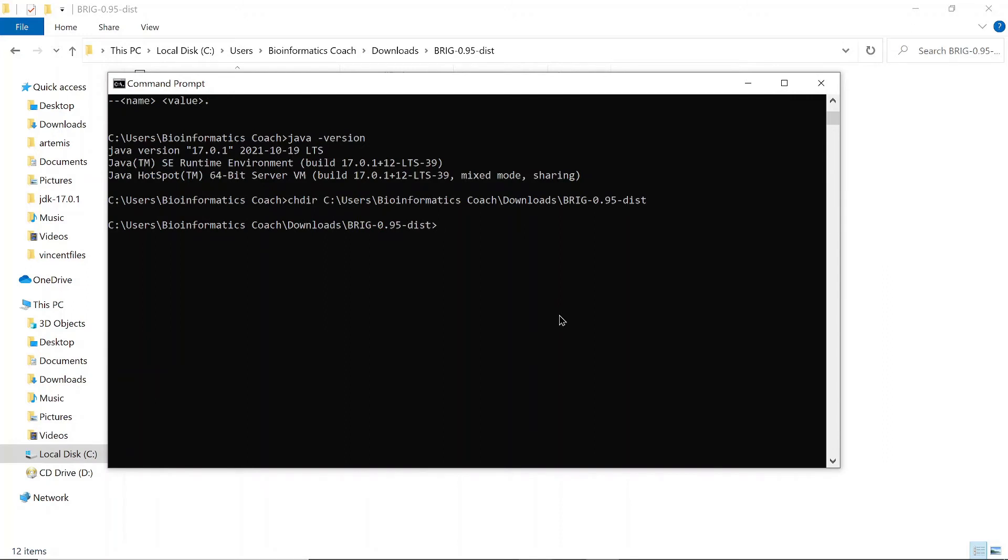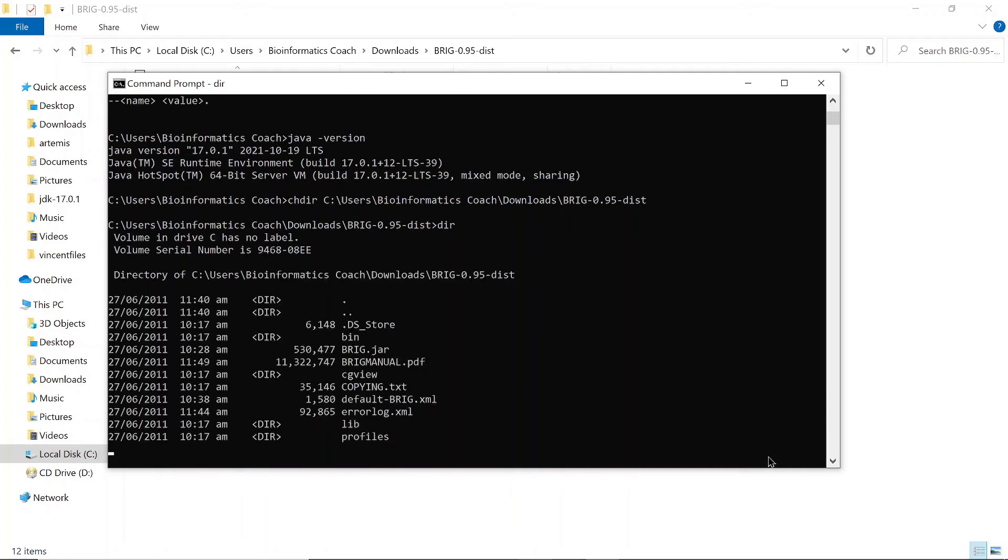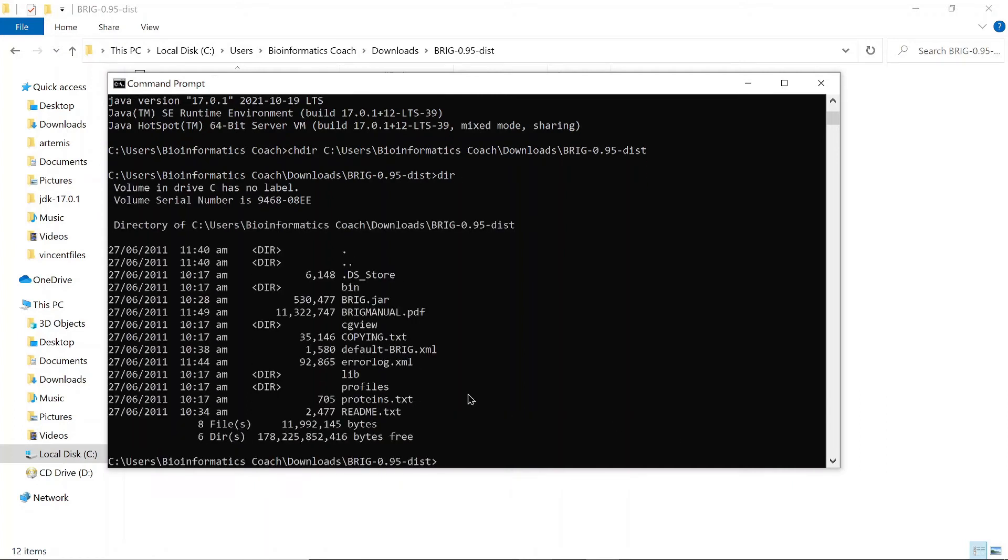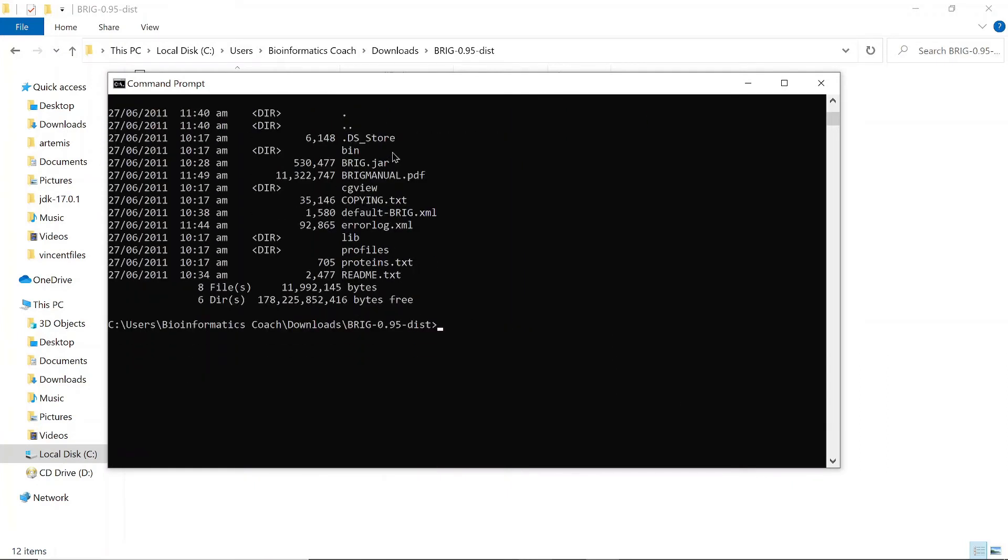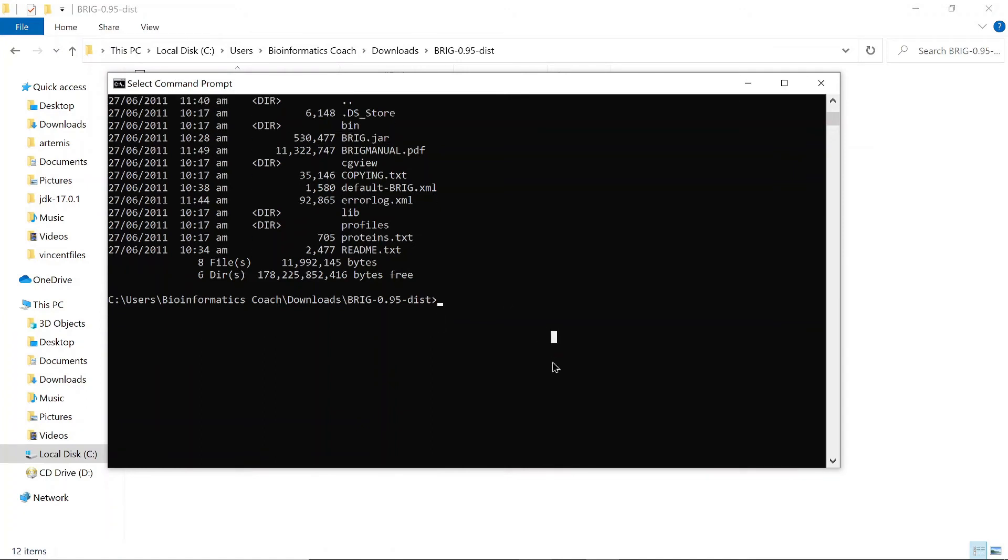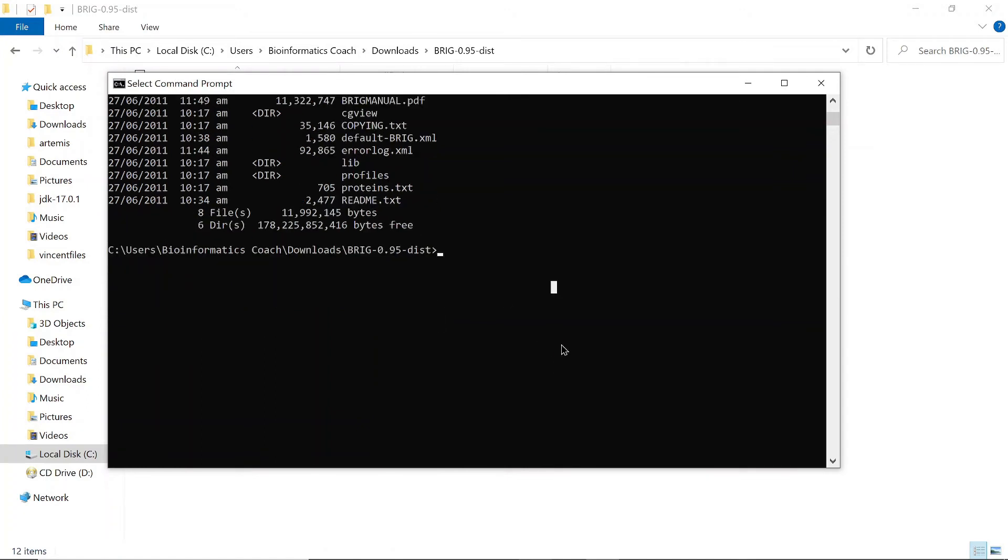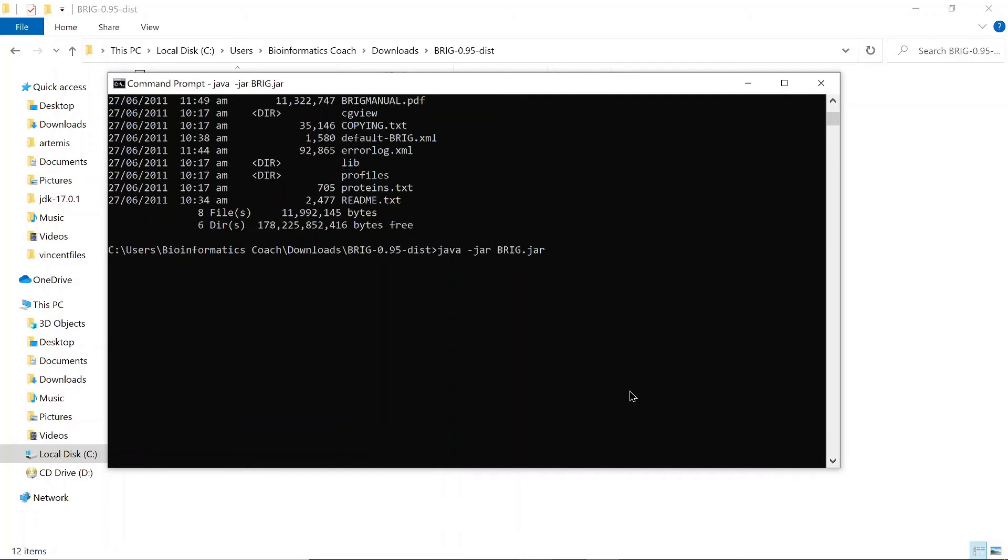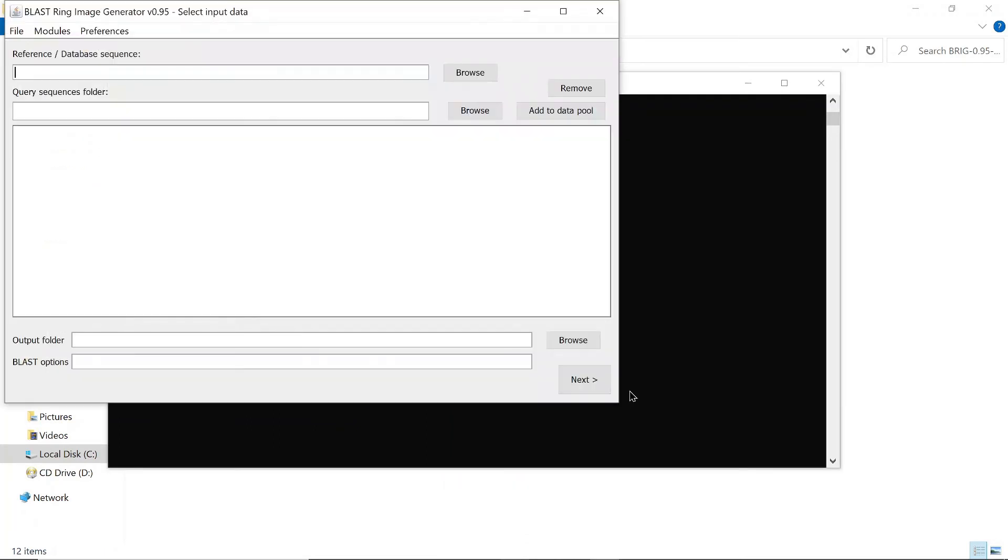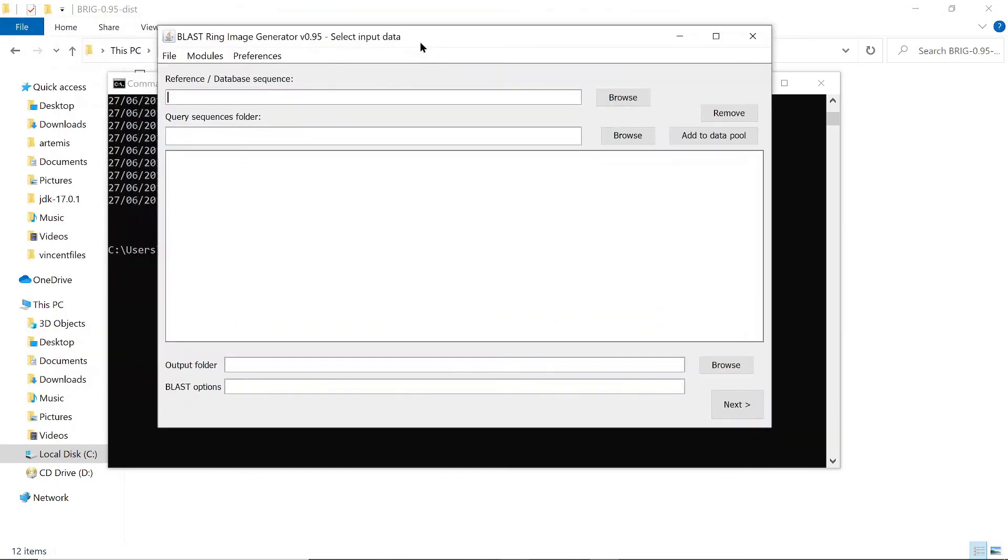So this file here, that BRIG.jar, that is what we are going to open. Once you are here, you just type 'java -jar' and you specify the file name, which is this, and then you just run it. So Java will open an application for you. Okay, so great. So this is how we install BRIG.